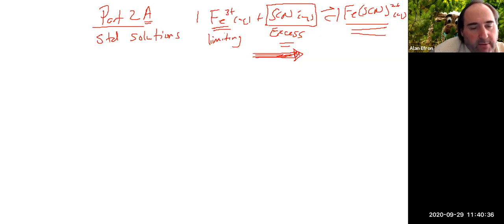So in part A, when we make these standard curves and we get the absorbance values, we are essentially getting the concentration of our product, because we're forcing it basically 100% to the right-hand side, and all product is going to be formed. So what's going to happen in part A is you'll get absorbance values for how many test tubes? I always want to say there's 5 of them, maybe 5 or 6 test tubes.